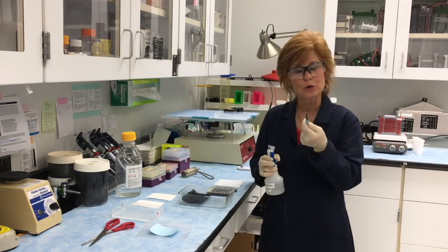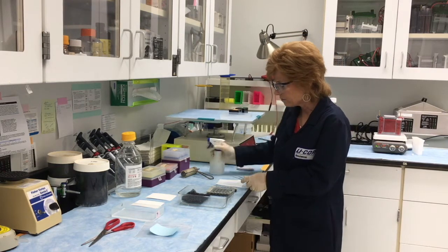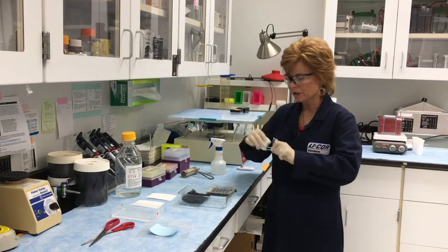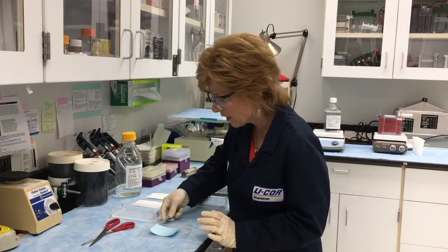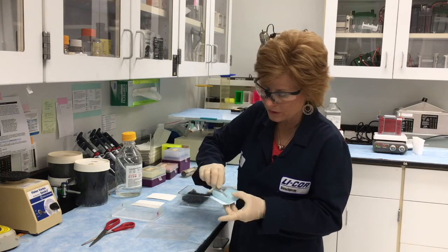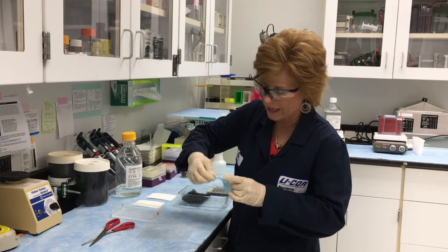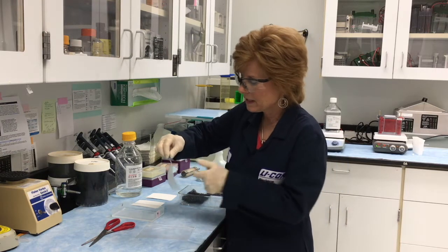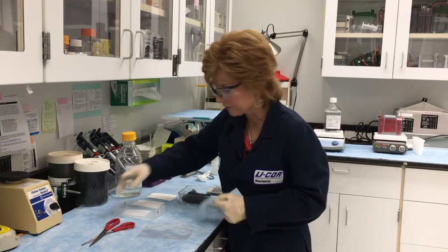I'm going to use a forceps to move that nitrocellulose into the container, but make sure your forceps are clean. I'm going to use some methanol and clean my forceps before I ever touch the membrane, because you want to make sure there's not any dye or other contaminants on there. Then I'm going to pick up the whole thing, fold the pieces of protective paper back, pick up the membrane just by the edges, remove the paper, and let it sit and equilibrate in the transfer buffer.